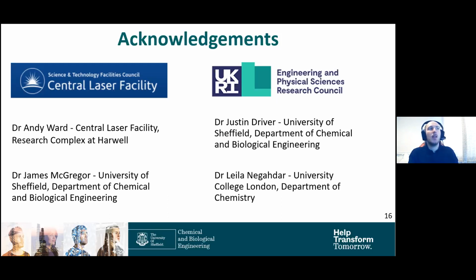Yeah, it's used a lot in biological samples, and they even use things like Fourier transform infrared and, like you say, Kerr-gate Raman. But yeah, absolutely, you can. It gets a little bit harder depending on what sort of intensity laser you want to shoot, because it can destabilize the droplet. But you can balance it. That's why you have the beam splitter, because then you can control the intensity of one beam to be able to shoot a different laser source at it.